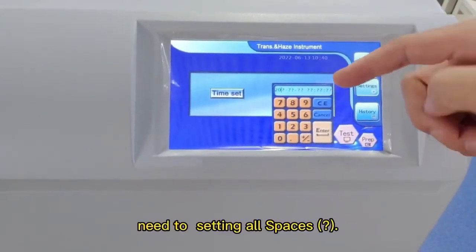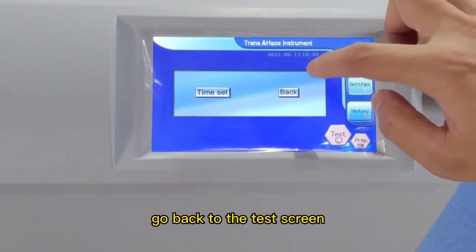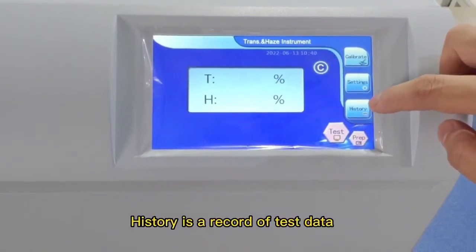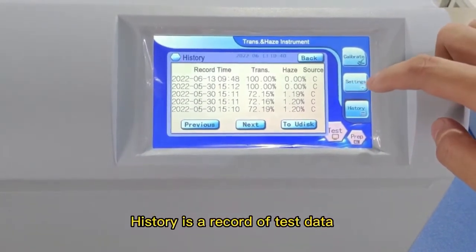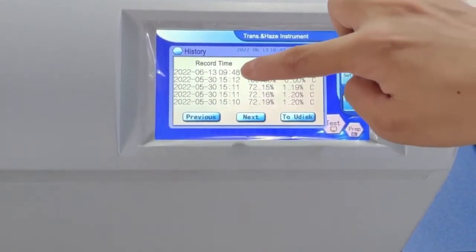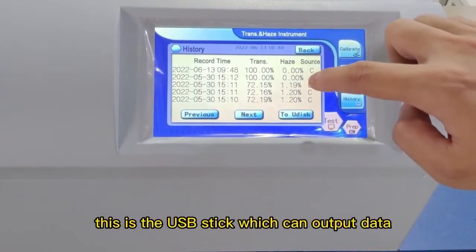Under settings, you need to set all parameters. History is a record of the test data. There is also a USB stick option which can be used to output data.